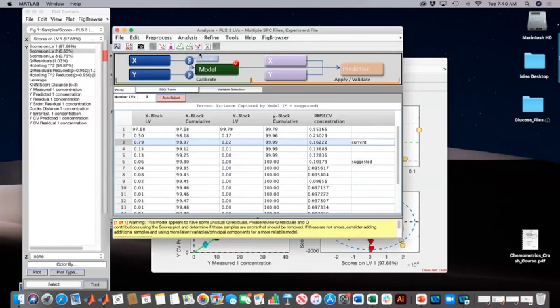We had a question about what LV to choose. I take it that you'll get to that in a little while, about where you might want to make that decision. Oh, yeah. One of the things I'm showing here is that it tends to be an iterative process where you find some things, and in this case, some samples you might want to get rid of.